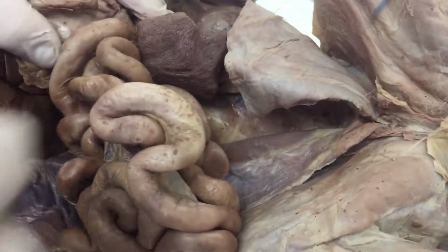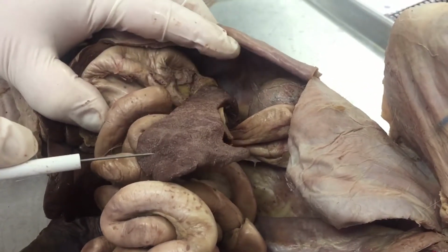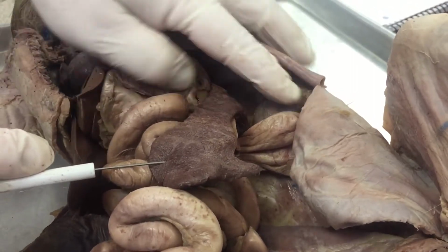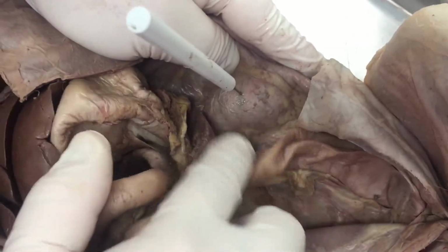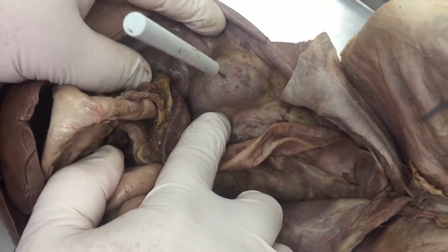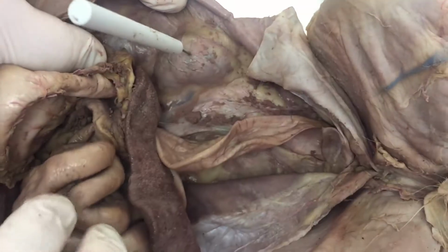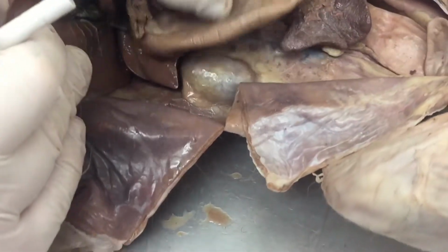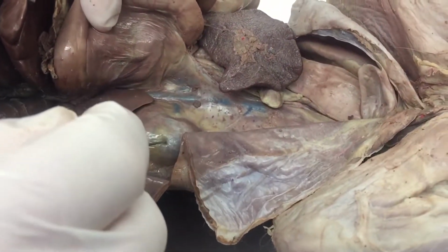On the left side of the body, you have this dark organ, which is flat and laying on the side. This is a spleen. That's all that you would have to say on that one. You don't have to define anything that it does. Along the back body wall, you will see these two bean-shaped organs, which are the kidneys, which are right against the back body wall, very close to the spine itself. So this is one of the kidneys, and all you'd have to do would be identify it. If we move all this stuff aside, which I'd have to do, we would have the other kidney right here.